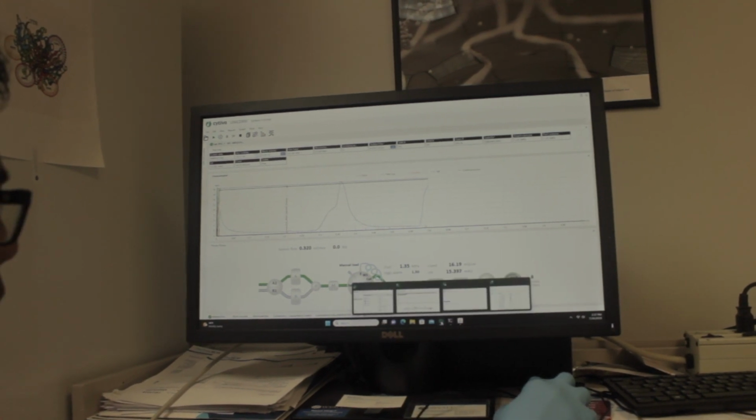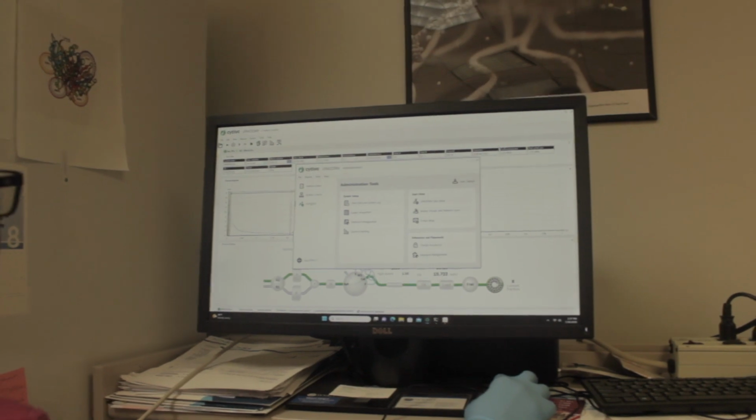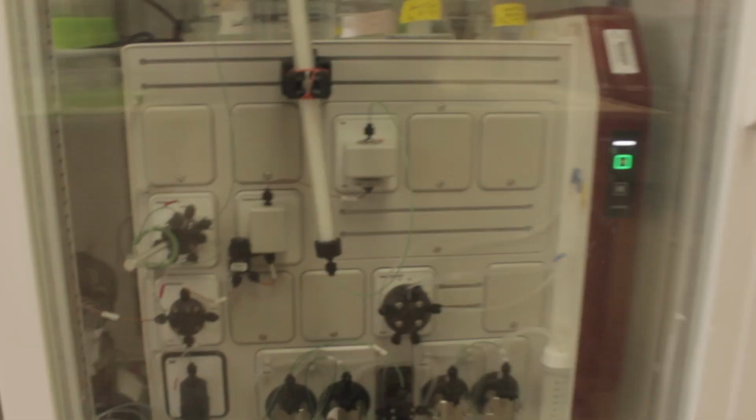To fulfill the objective of my project, we develop many approaches and techniques, like cloning and site-directed mutagenesis, to make many mutations in particular proteins, alpha-synuclein and transthyretin, to replace specific amino acids with another amino acid and check the particular effect of these amino acids with the lipids and fatty acids.